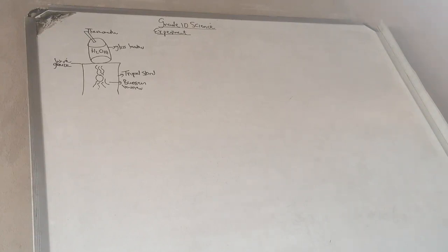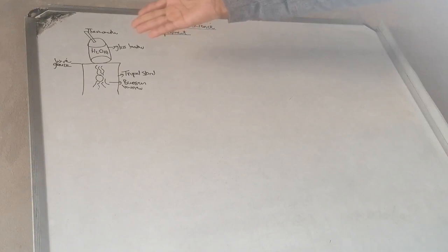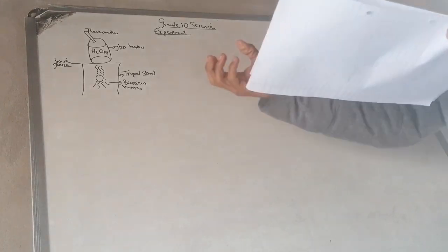Right, and then number three. Place the beaker on a gauze wire on a tripod stand. That's exactly what we have done there. Number four, gently heat the beaker using a Bunsen burner.